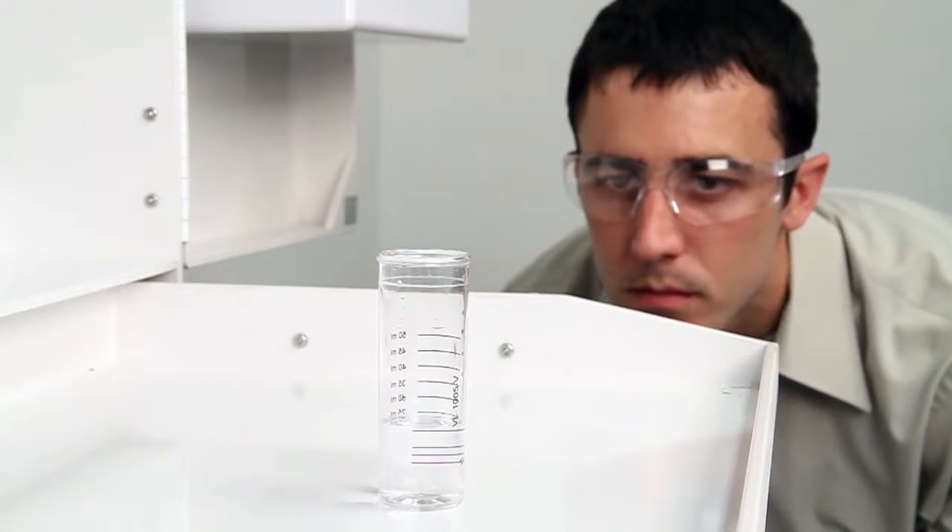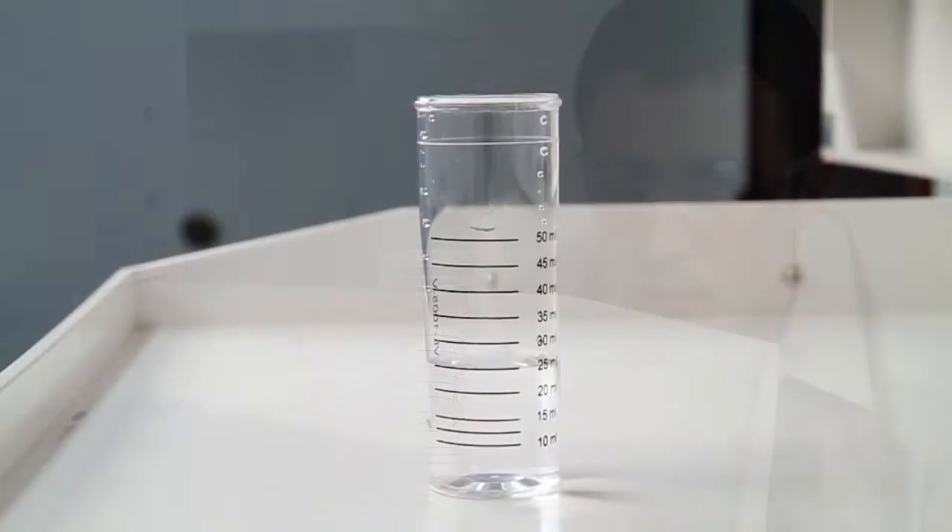Using a white background while performing your test will provide contrast to help better see the color changes. A white cabinet tray or a paper towel can provide that contrast.